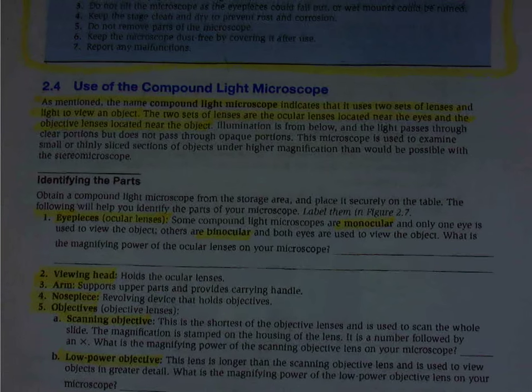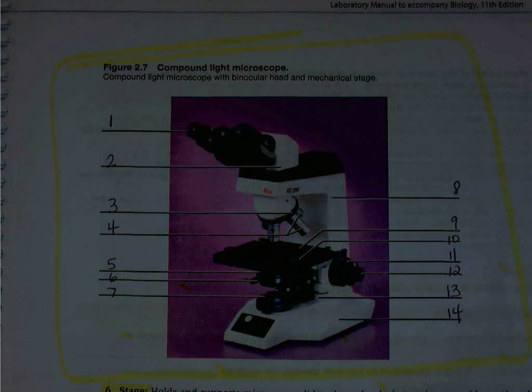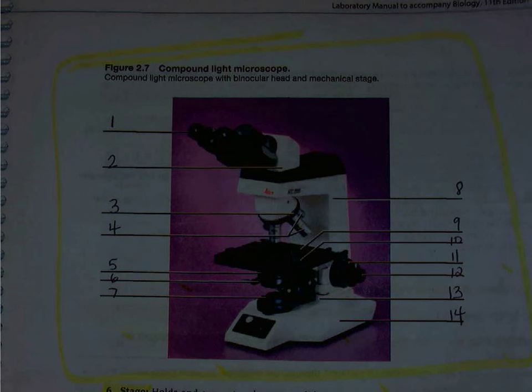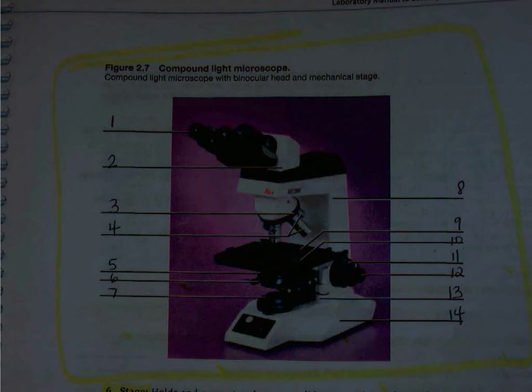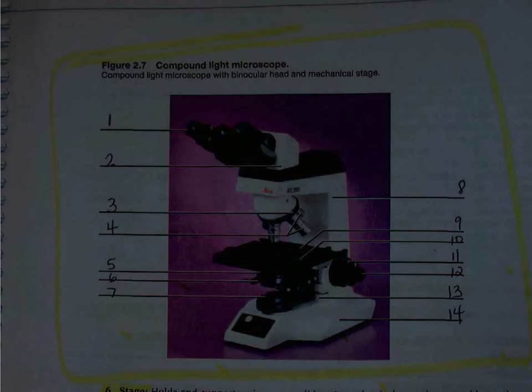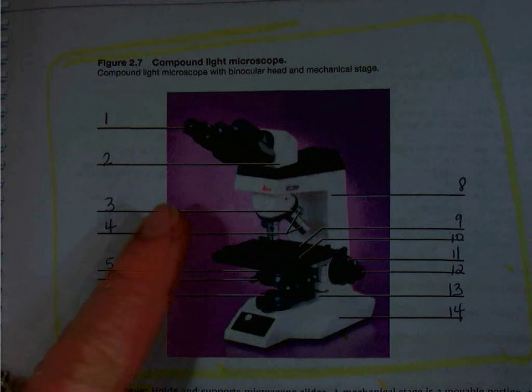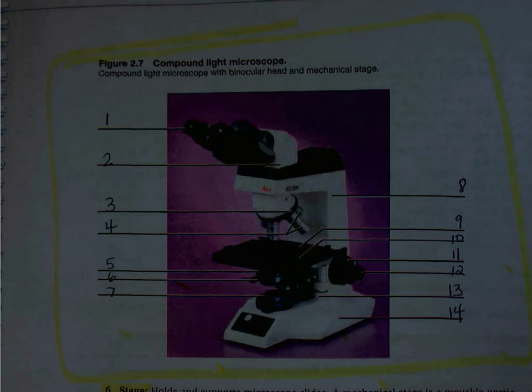So you should know the parts of the microscope by what the structures do, what's their function, as well as you should be able to label the parts of the microscope. You should be able to correctly identify the parts of the microscope. Most of the time I have real microscopes sitting out, have a large arrow pointing to a specific part of the microscope, and you're going to find the microscope part on a list of the multiple choice selections and pick the answer that best matches where the arrow is located. So be sure you know the parts of the microscope by structure, what they look like, where they're located, and then also by function. What does each part of the microscope do for us?